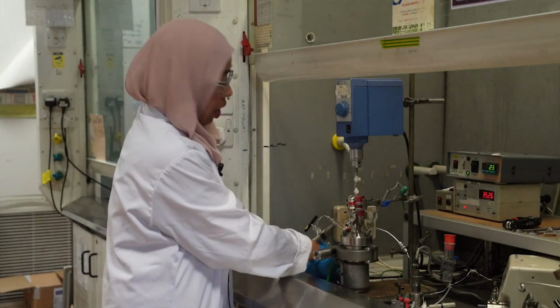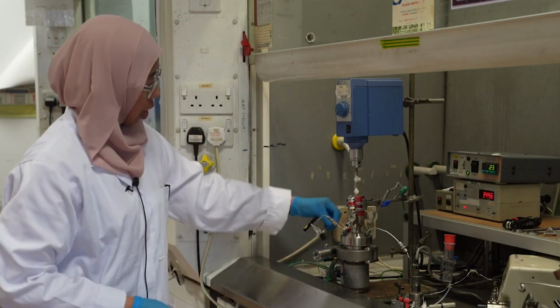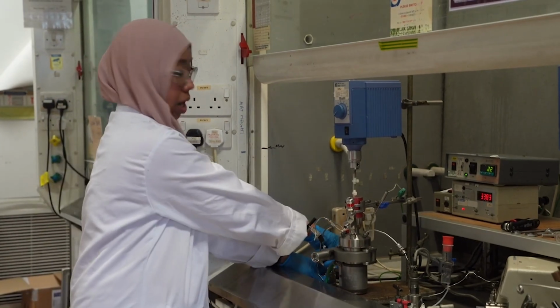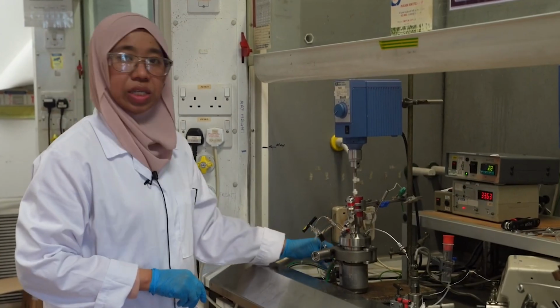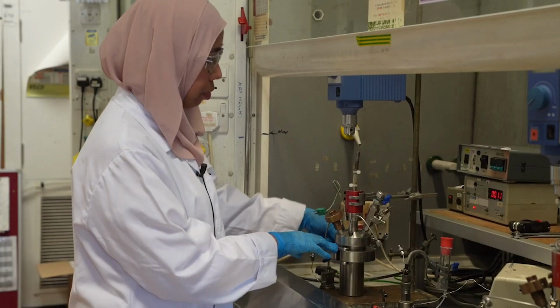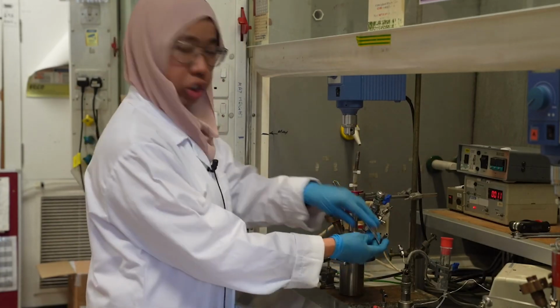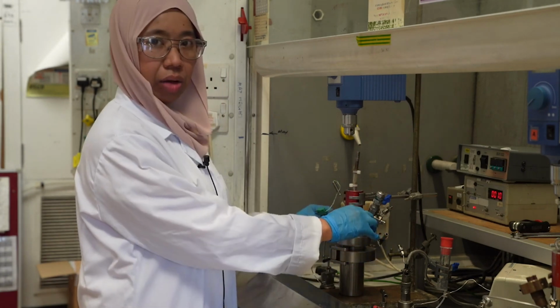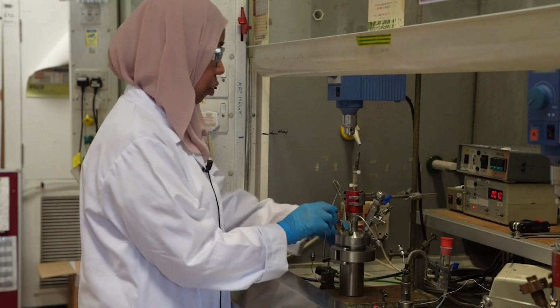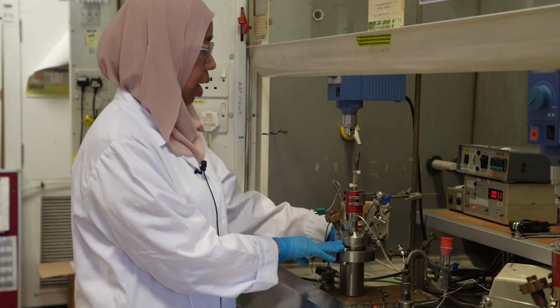And then now we start to vent it. So we vent the system using the outlet tap here, and make it slowly. We've done the depressurizing, okay. So now I've already detached all the joints, the inlet and the outlet joint. And now I'm going to open the autoclave and collect the product.